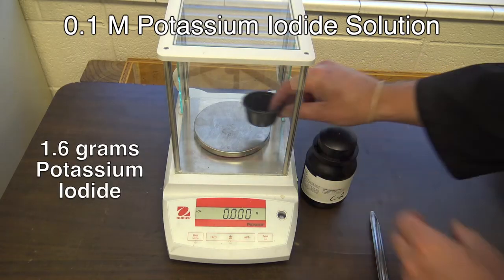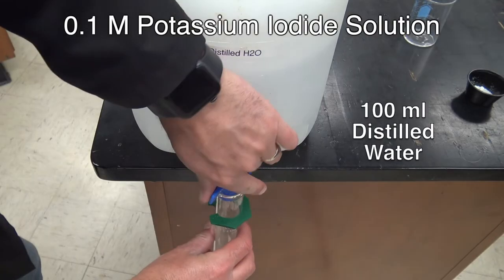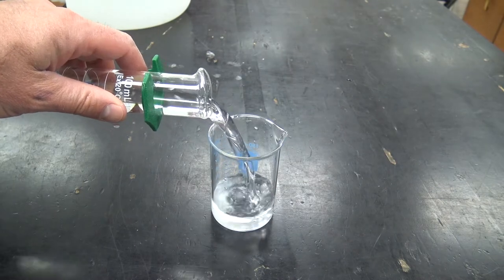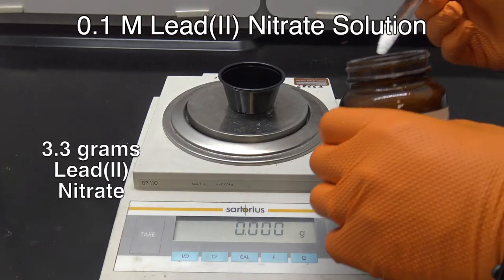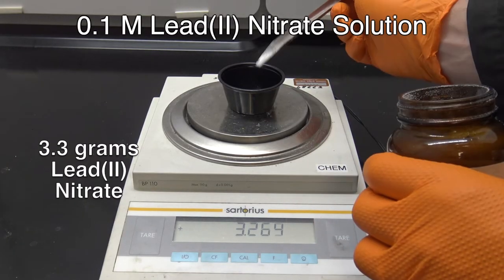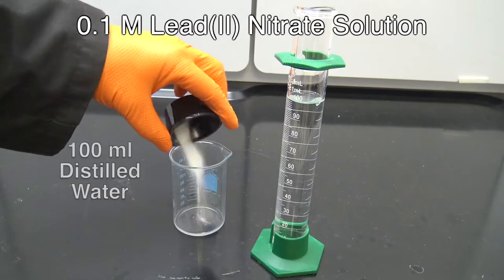The first solution we need is 0.1 molar potassium iodide — that requires 1.6 grams of potassium iodide dissolved in 100 milliliters of water. The second one is 0.1 molar lead nitrate — we're gonna need 3.3 grams of lead nitrate dissolved in 100 milliliters of water.